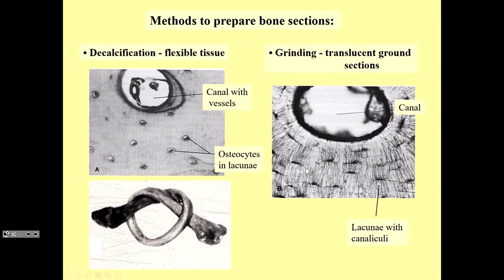Or you can actually grind down the bone to a very thin sliver and maintain the bone in the inorganic component, the hydroxyapatite crystals. So you grind it down to an extremely thin sliver, and then you mount that on a microscope slide.